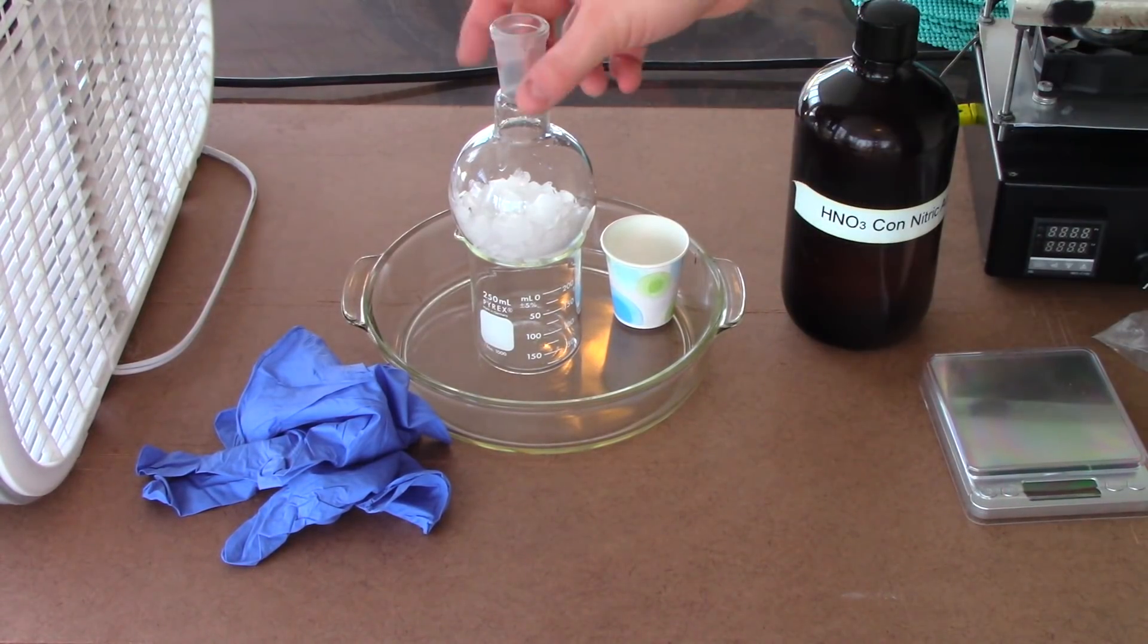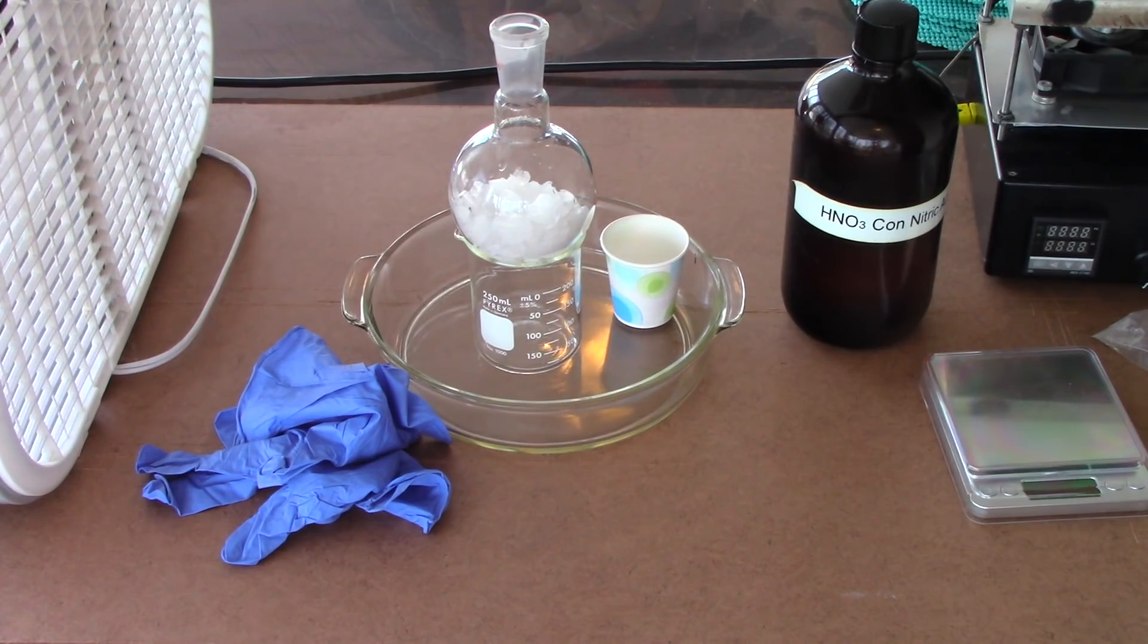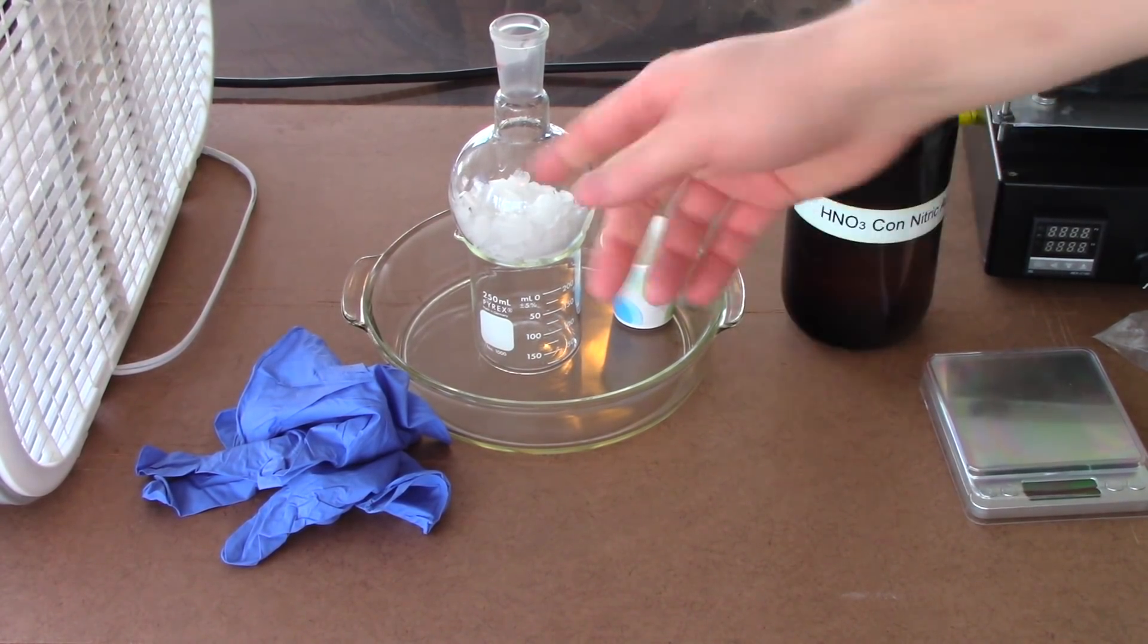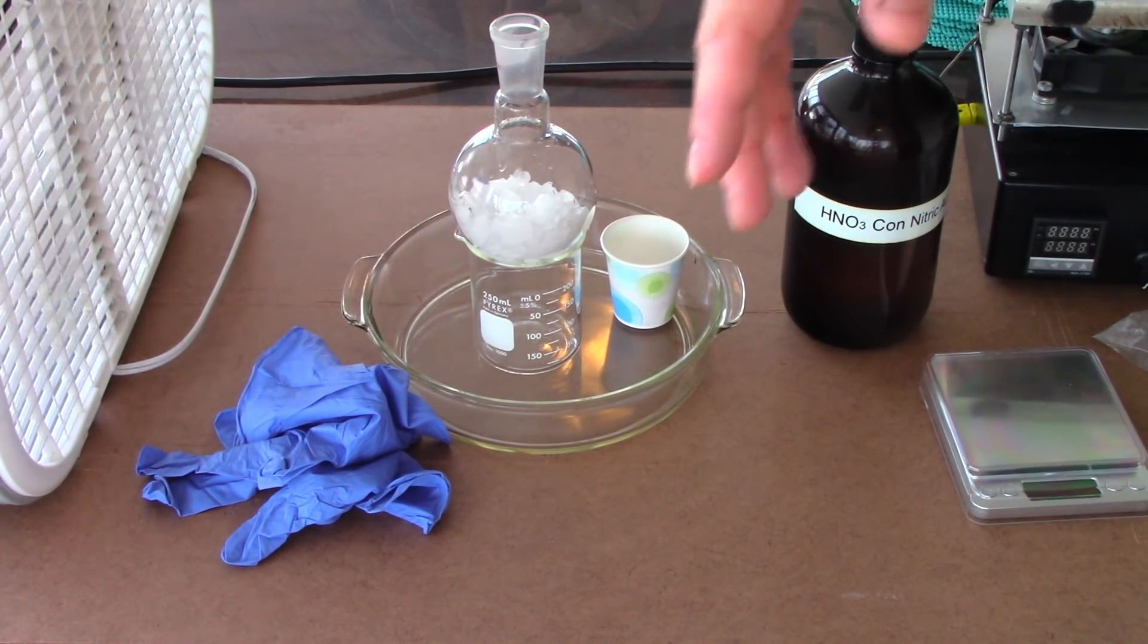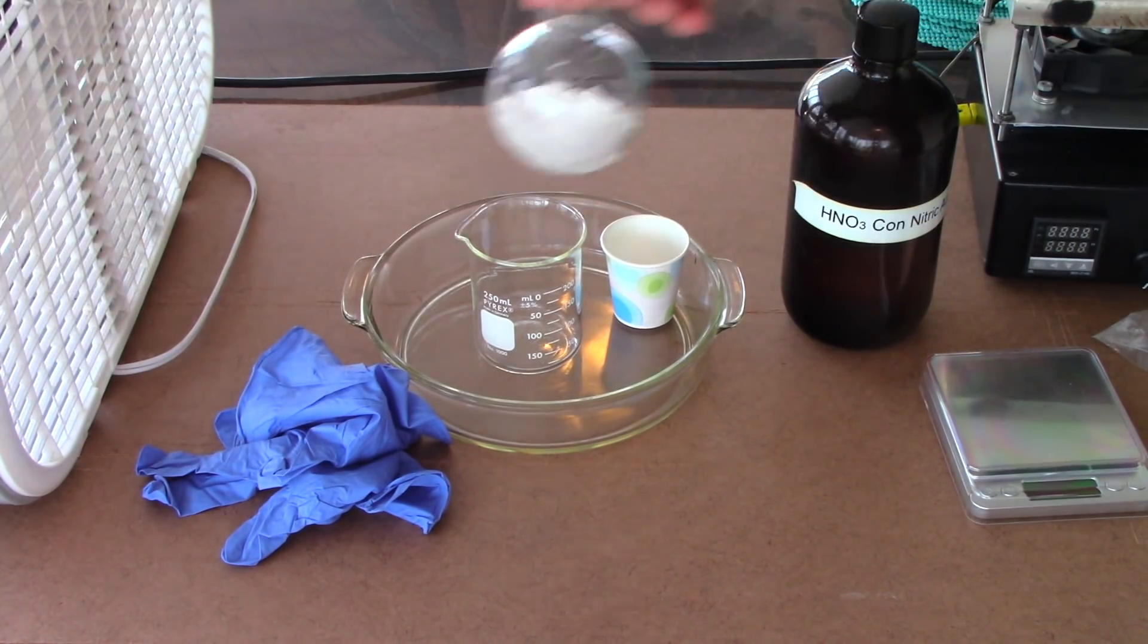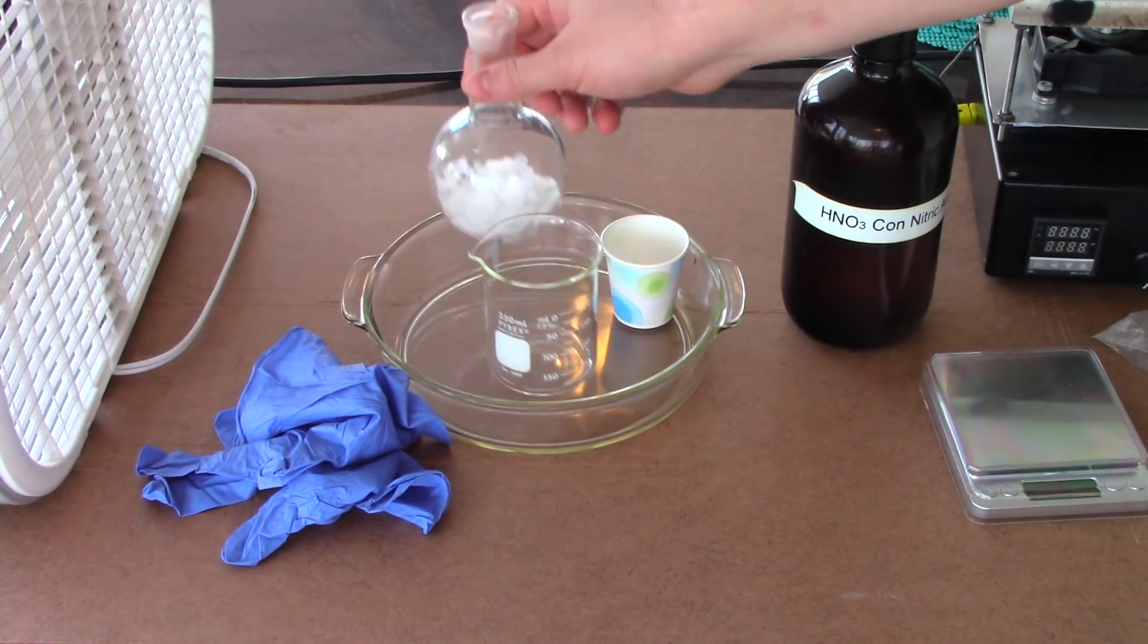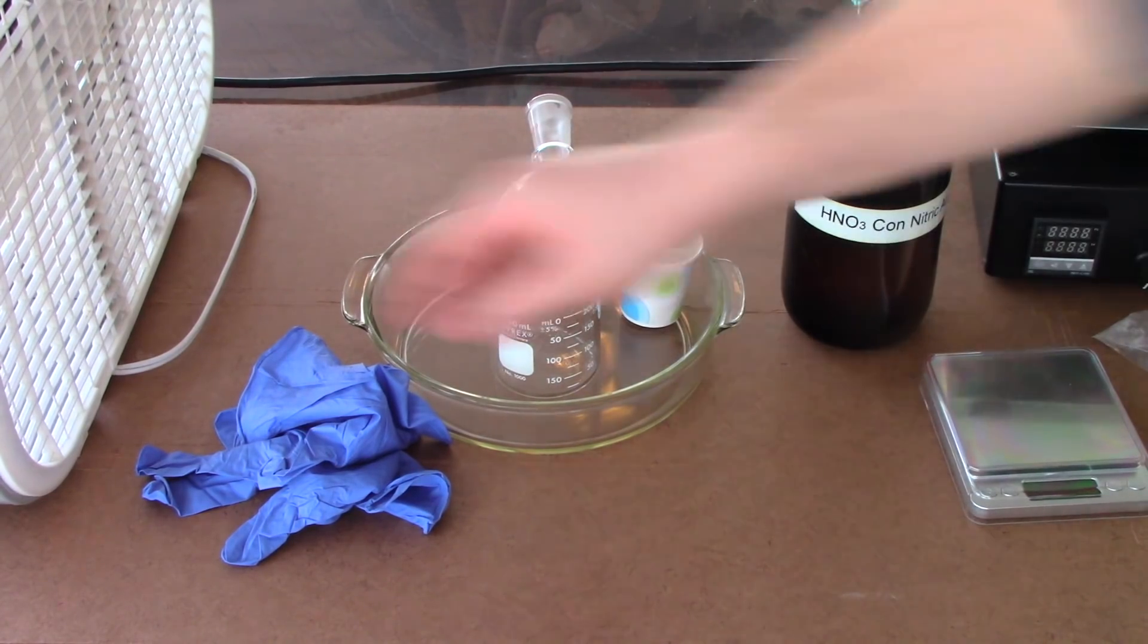All right guys, so here we are outdoors. I have a fan set up here to pull fumes away. Obviously working with nitric acid, it's going to produce some nitrogen dioxide fumes. And even though we're outdoors, still I want to get them away as quickly as possible. So, just venting those off to the side. Got a round bottom flask just to recondense some of that nitrogen dioxide fumes. And we have our nitric.